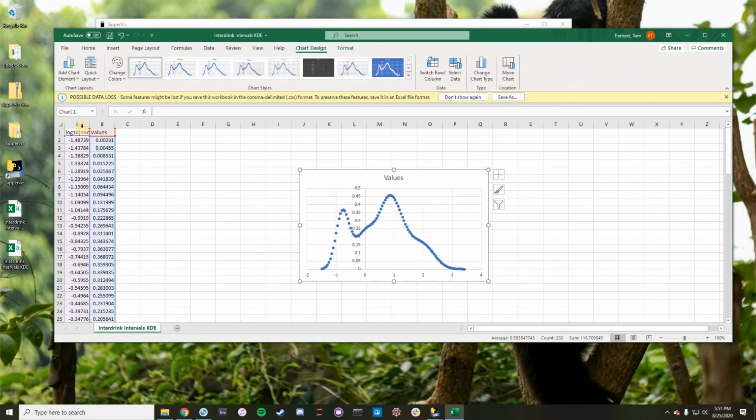So this is, again, maybe not the most helpful use of this, but you should be aware of this as we get into more complicated plots that are aggregating data. It can be helpful if you want to get that data out for either making your own plots or doing statistics or anything like that.